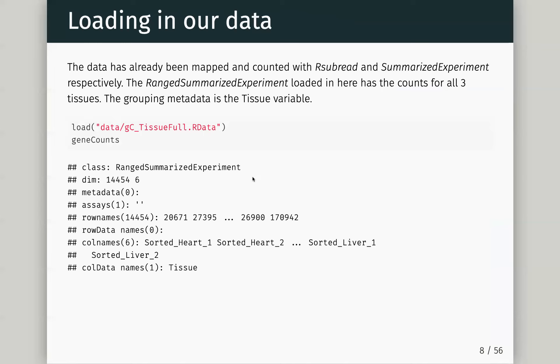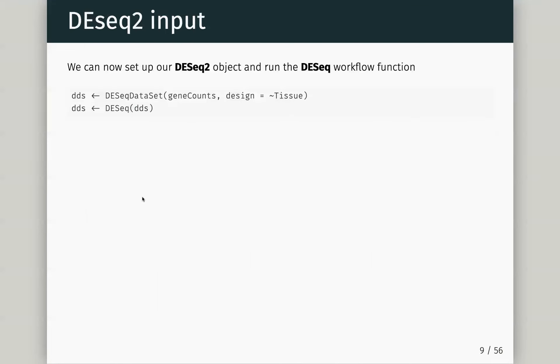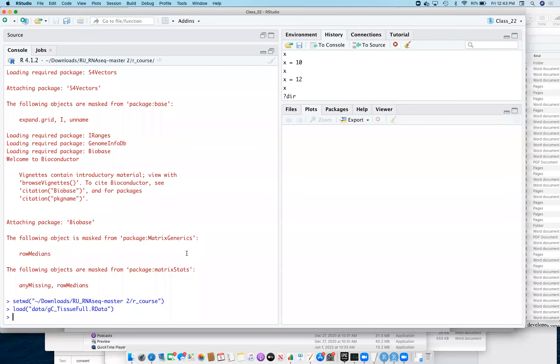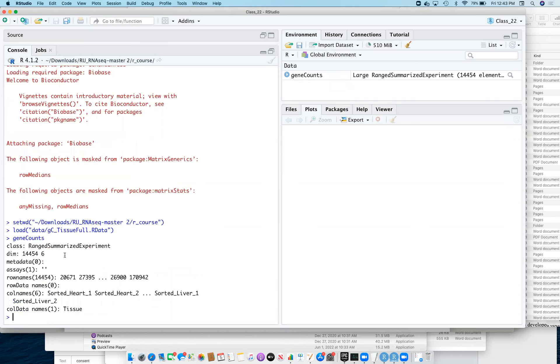So it's already been mapped, counted with our Subread, and then I've used the summarizeOverlaps function to create our RangedSummarizedExperiment data. It looks like this, and we can then process that further with DESeq2. Let's just have a reminder of our RangedSummarizedExperiment object. So what was it called? We can look in the environment — I have gene counts. The class is a RangedSummarizedExperiment.